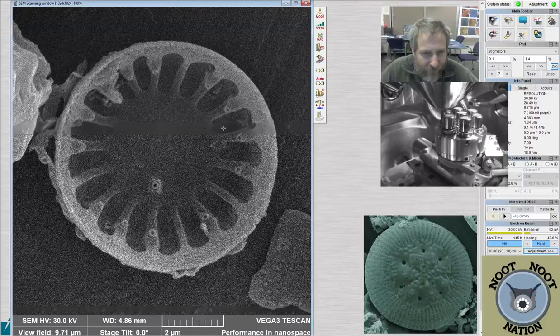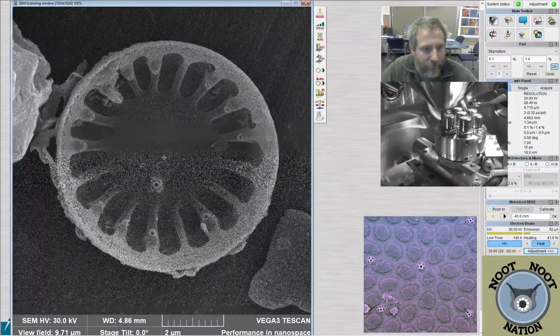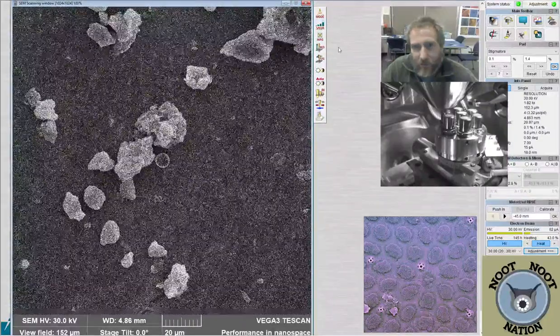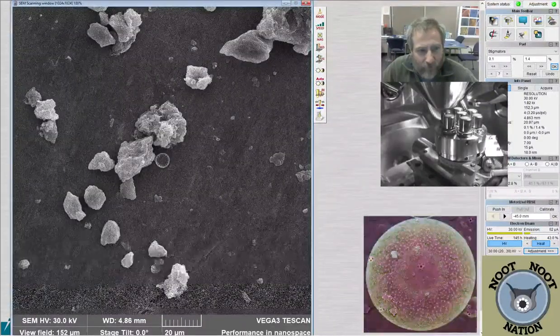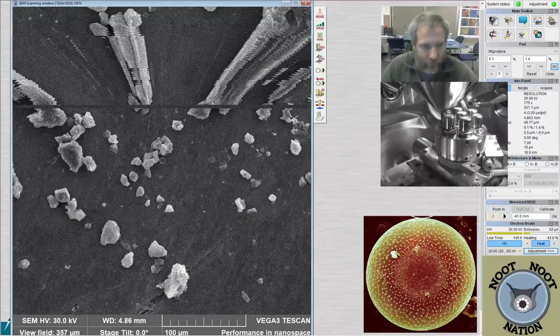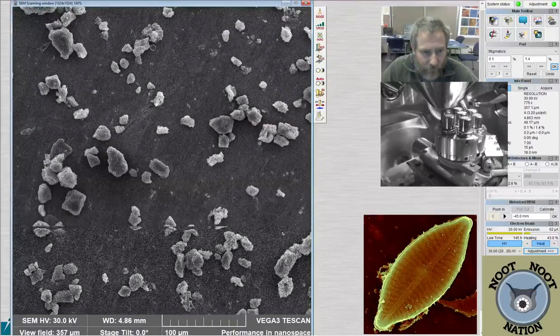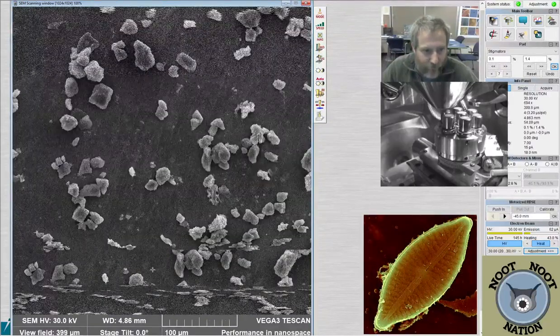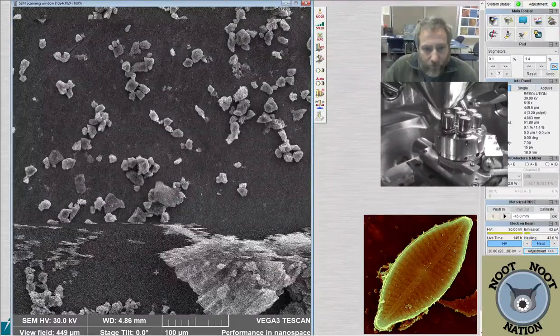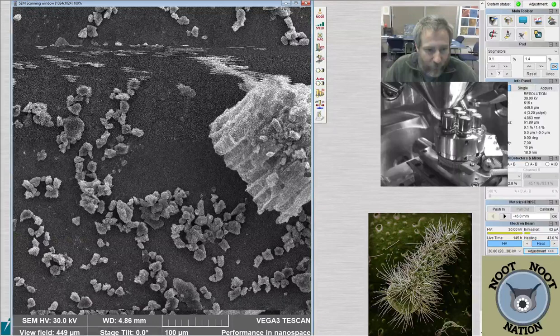They're still there, they're just not as obvious. Nope, it's still there. So I think I'm going to have to abandon taking this picture because I'm not going to be happy with lines going across it. That's just because there's some high topography over here and it's causing interference with the actual diatom as it scans across. I think we'll have other candidates that we can take pictures of for Cyclotella meneghiniana anyway. Maybe they won't be as clean or as obvious as that one, but they also won't have lines in them.